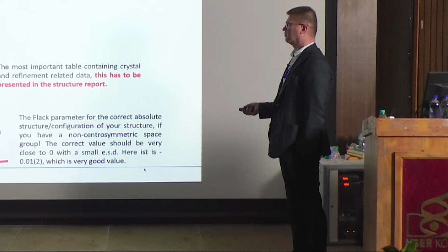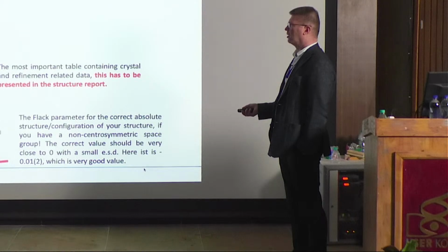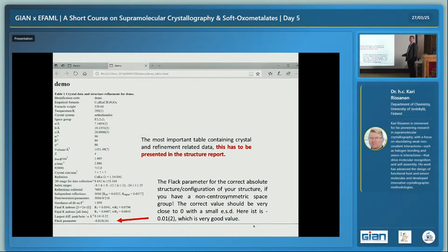Previously it was valuable. Then this F000, actually the number of electrons, and that number of course indicates how many electrons, and it is an indication about the diffraction power, but also about the content. This number is actually 4 times the electrons, as we have 4 molecules, but it prints it out. This was again an important number indicated 20 years ago, and has lost its importance now. It's not so important. What is important is the unit cell, of course, and then the space group, and then the molecule itself. And then the crystal size; we didn't indicate the crystal size, but this is crucial information.